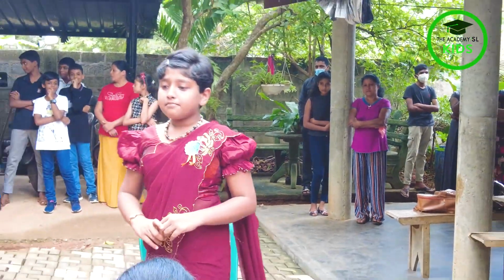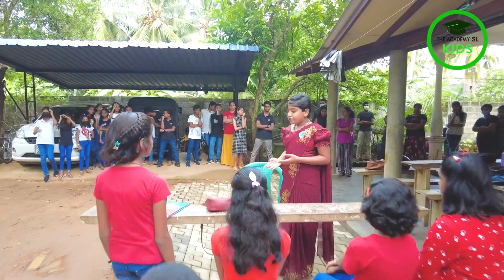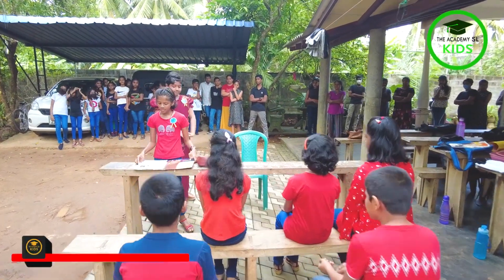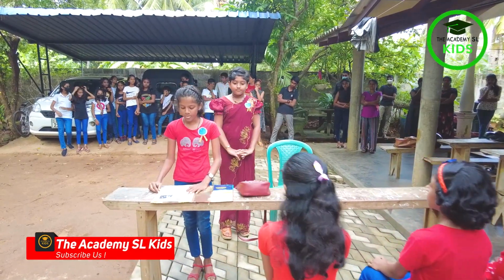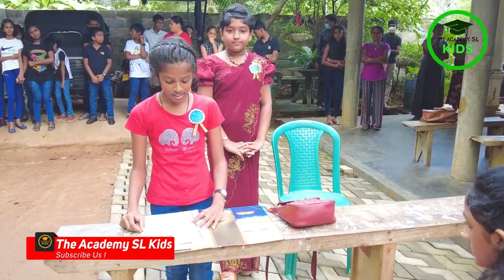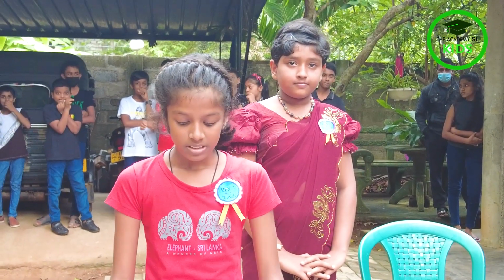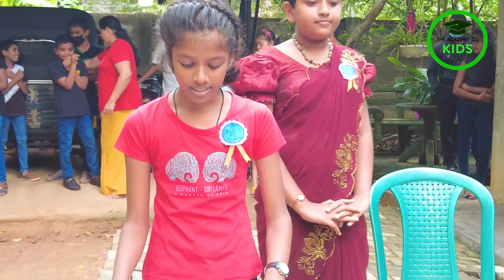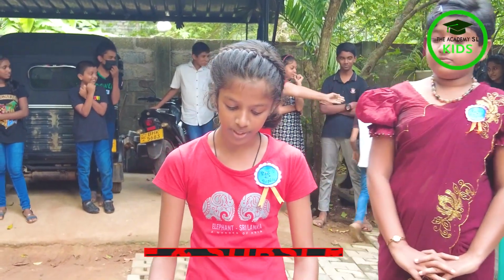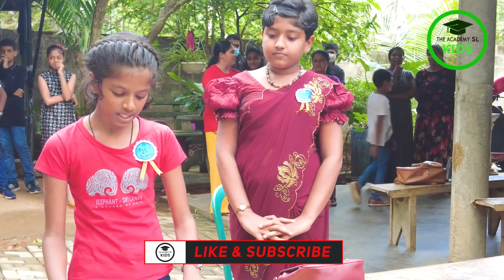Did you do the assignment I told you to last week? Of course, teacher. Then come and read yours. The correct method to use the compound light microscope. First, keep the microscope on a horizontal table steadily. Second, use the coarse adjustment knob to bring the low power objective lens down. Third, adjust the mirror and the diaphragm to obtain a clear spot of light by keeping the eye open on the eyepiece. Fourth, stick the prepared slide on the stage using clips.